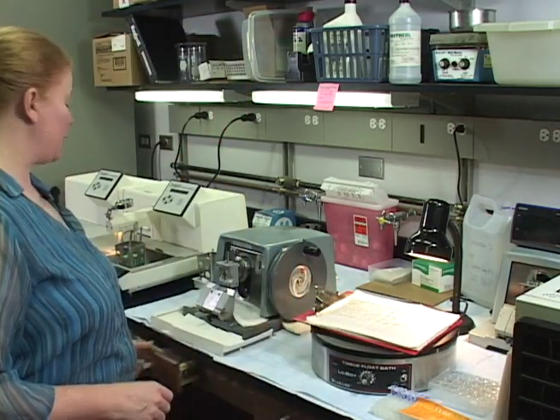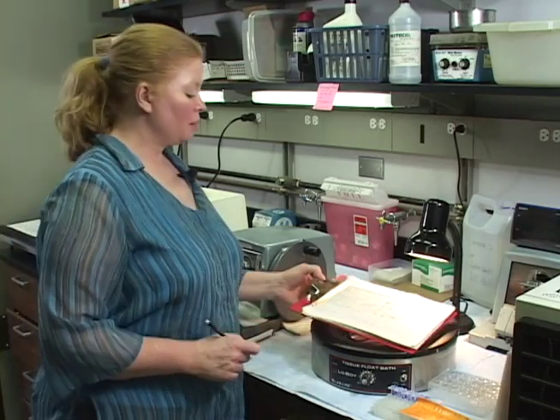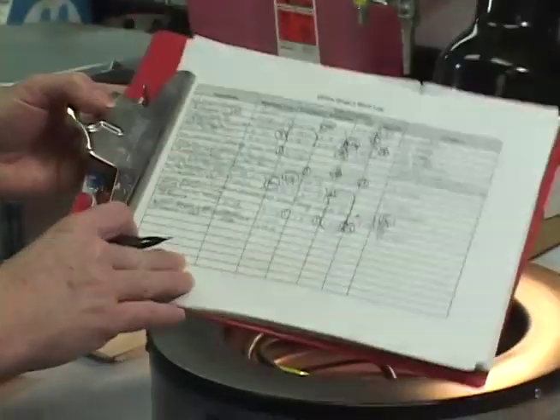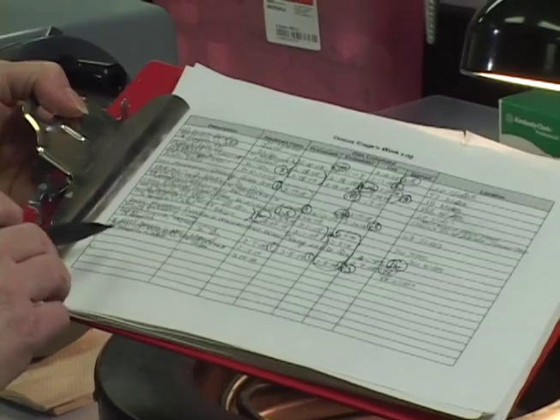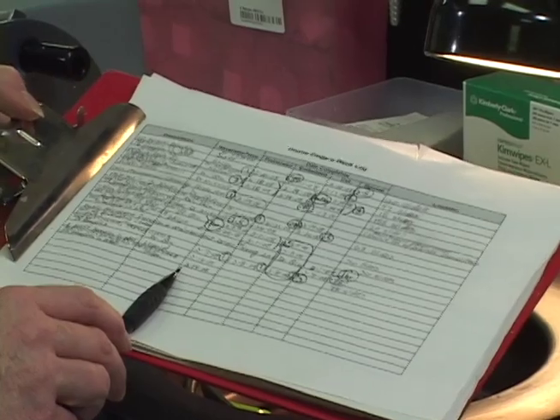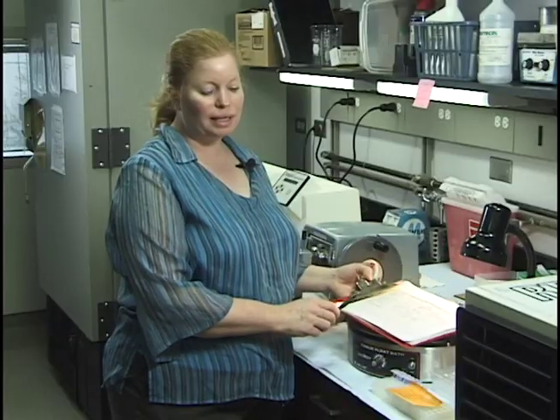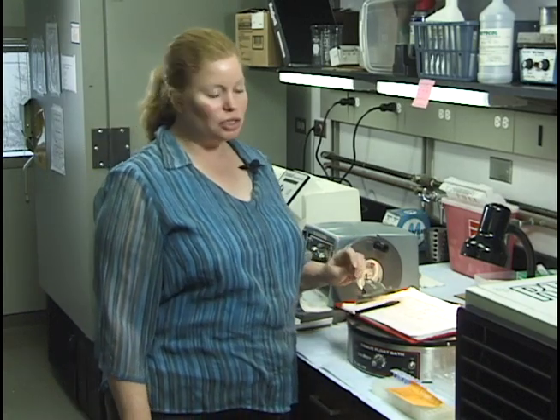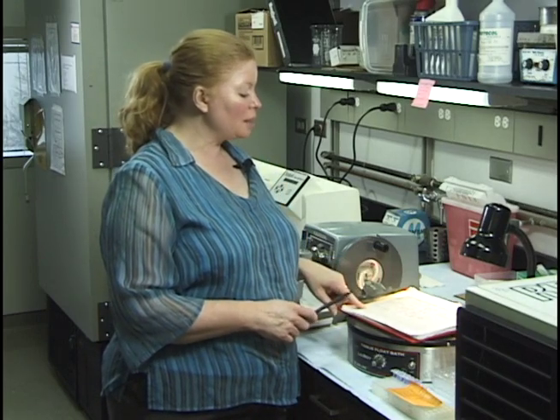Anyway, I always enter the samples on some type of log, and I recommend that everybody do this with every sample they process. Make your log clear enough that you have the specific samples and the date that you processed it. The reason is, and we've come across this here in this lab, occasionally the samples come out dry, and there's a question of whether it was a processing error, a sample preparation error, or a fixation error. You may even want to add some times of fixation just for your own information.